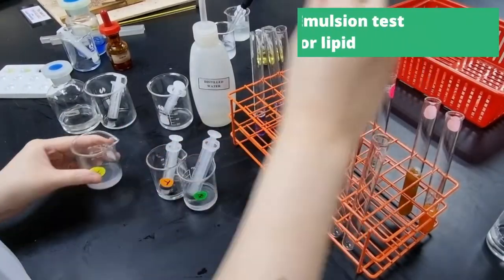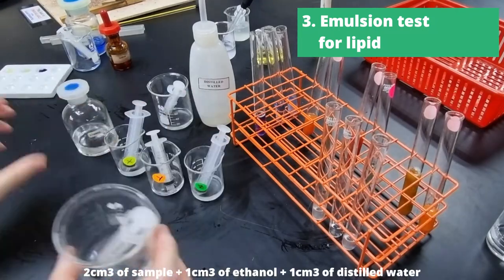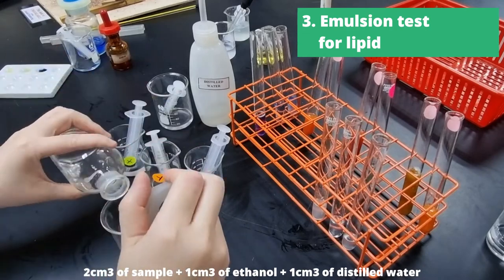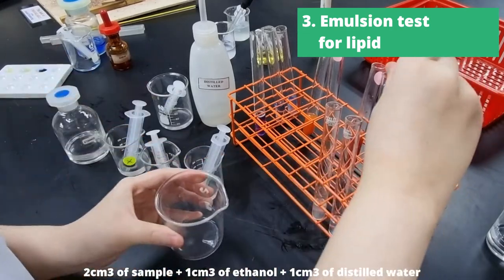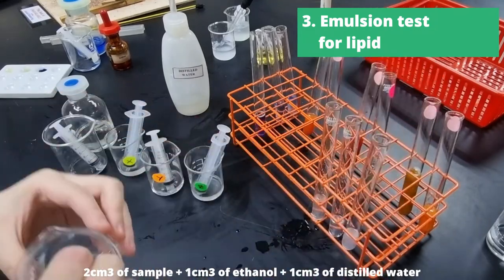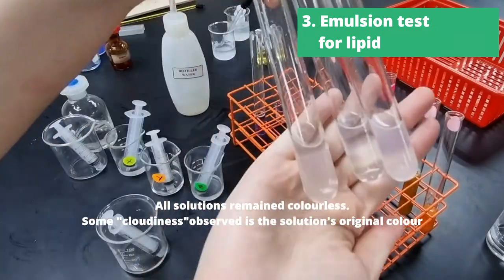Next up, we have the emulsion test for lipid. We'll take 2cm³ of the sample, then add 1cm³ of ethanol and 1cm³ of distilled water, and then shake the test tube vigorously. The results showed that all solutions remain colorless.